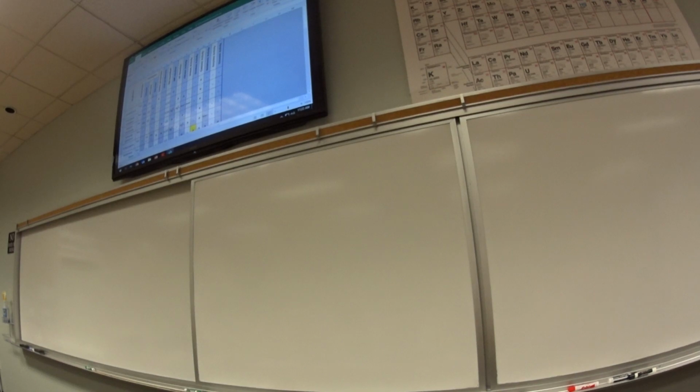There are 2 tests that I demoed for you guys last week on Wednesday, where the results were immediate and fast. Do you guys remember what those were? Oxidase and catalase, thank you. So those were pretty fast and immediate. So can you do those on the same day on Wednesday? Yes, I will have those there for you too. Now, but should you do them? Depends.